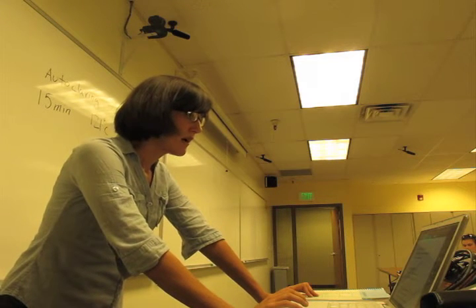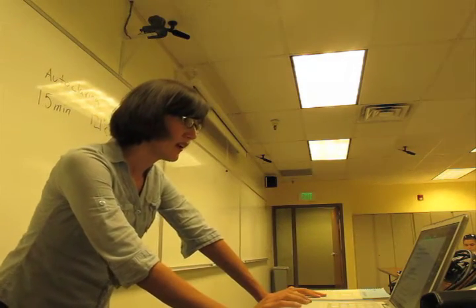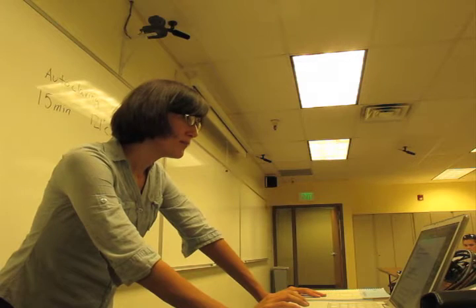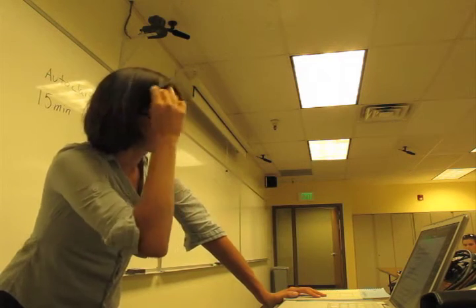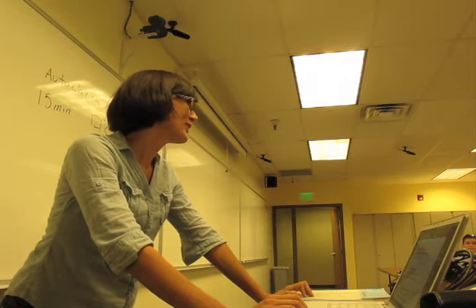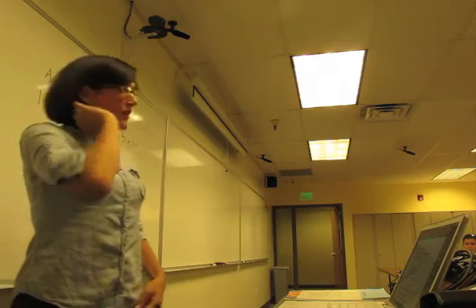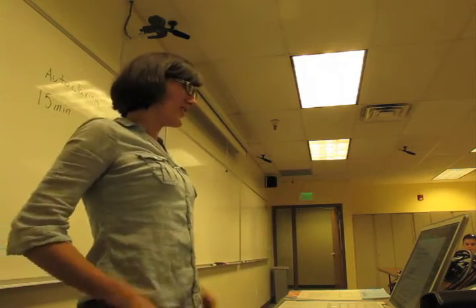So moving on to lab 5. Any questions on lab 4? Good. Okay, lab 5. How and why do you fix a sample on a slide? It's pretty simple, but I know he asked about this on one of our quizzes, so I would remember how you fixed the sample.